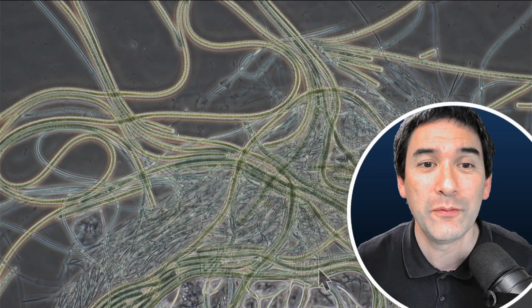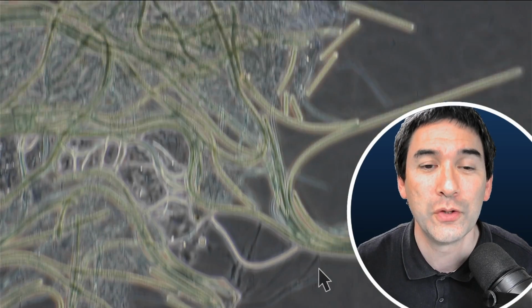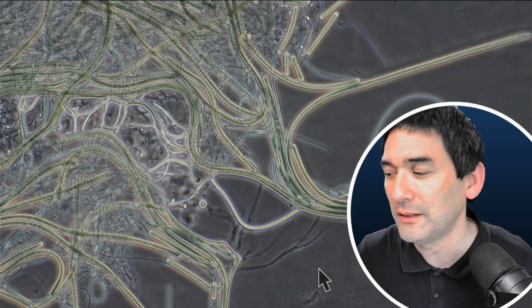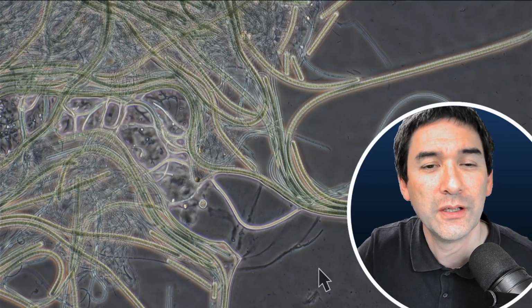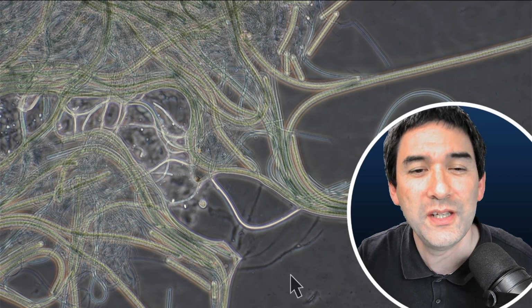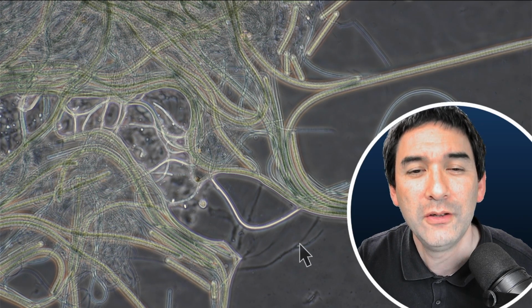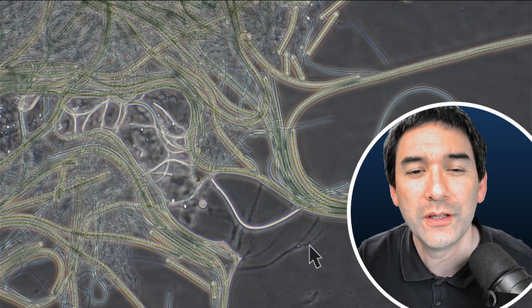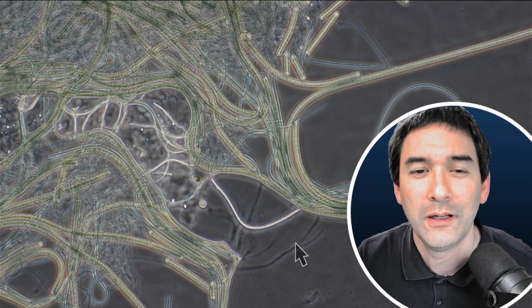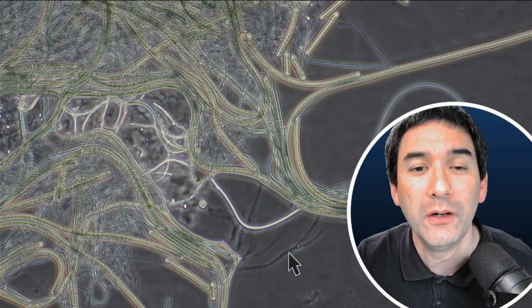Yeah, here again, we've got a whole bunch of cyanobacterial filaments. Look, but honestly, look at this. Oh my gosh. Another thing that I would like to point your attention to. Do you see those filaments here? Do you actually see it's branched? Cyanobacteria are not branched. This appears to be probably a fungus.